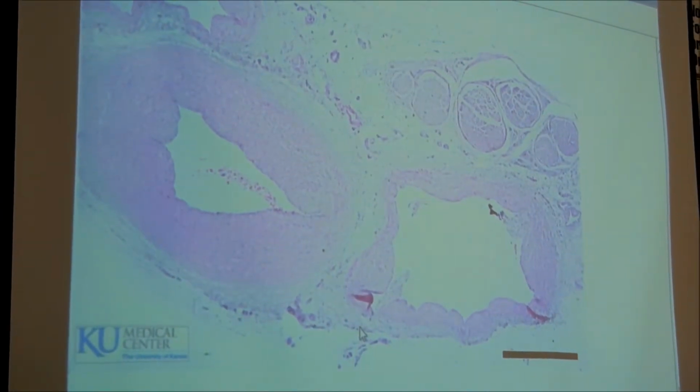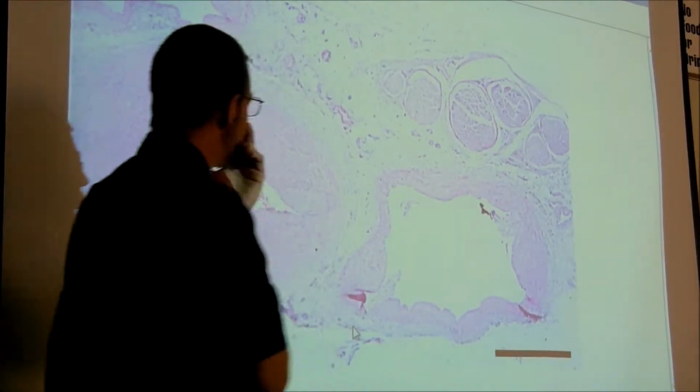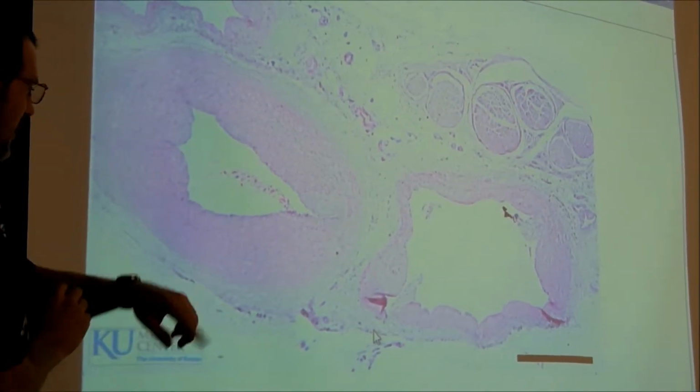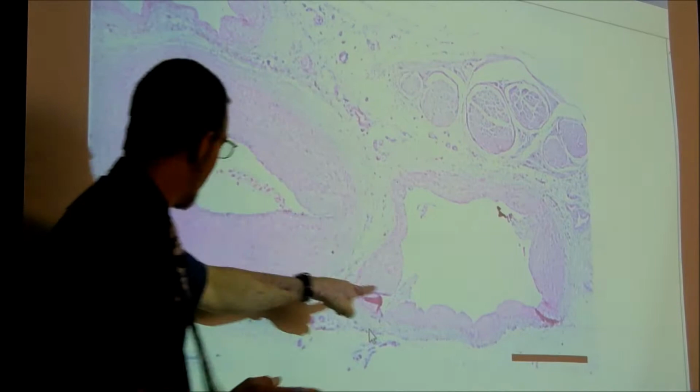You have a lot of things on the slide. Makes it a little bit harder. Artery. Where's the artery? Right by your, this one? Yes. We say, well, it's not always perfectly round. But the trick is it's rounder than this thing, and it's thicker.